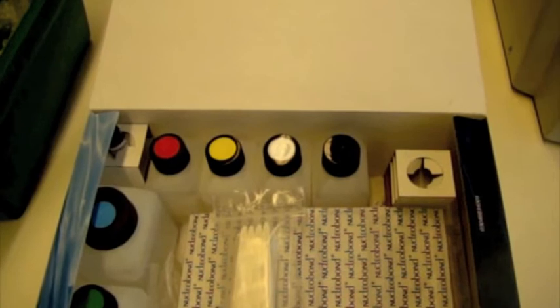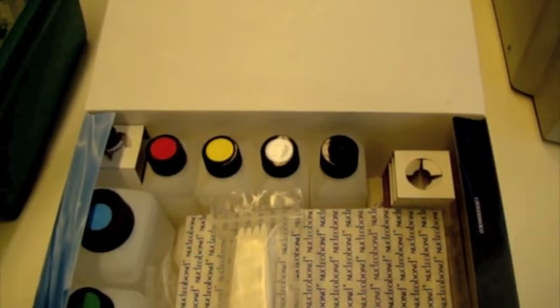MidiPrep is a medium scale purification of plasmid from a bacterial culture, used to describe preparations from 10 to 100 milliliter culture.